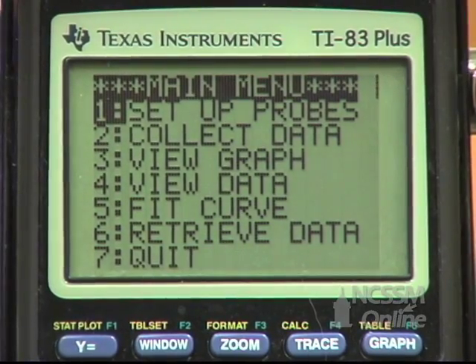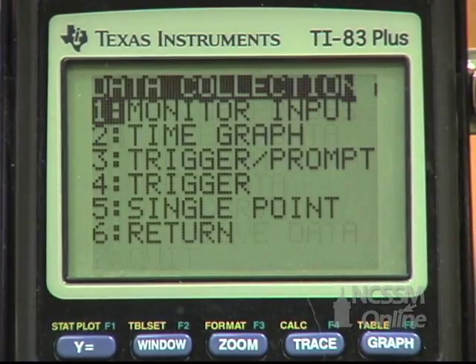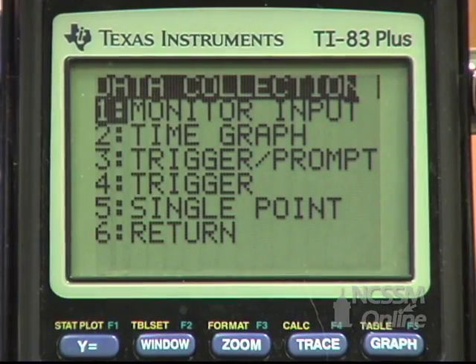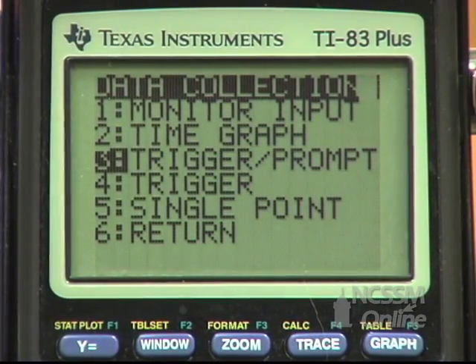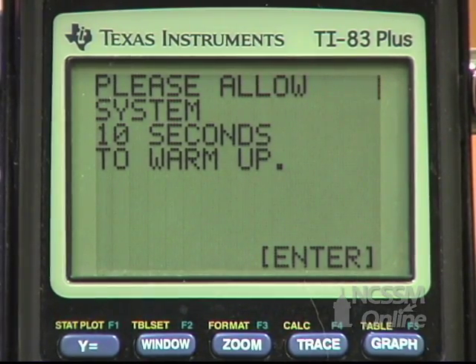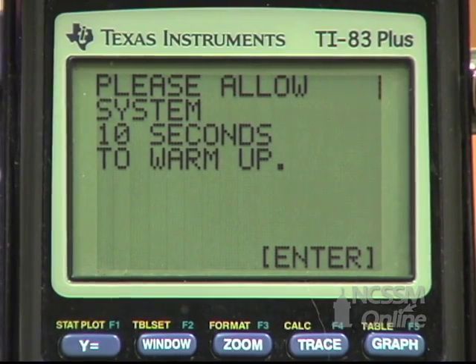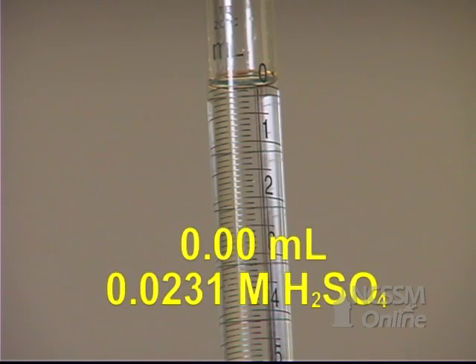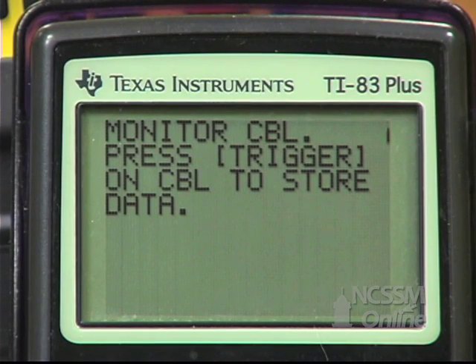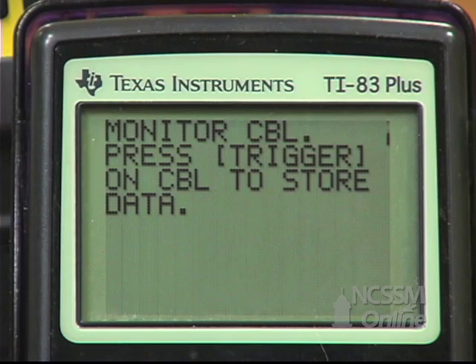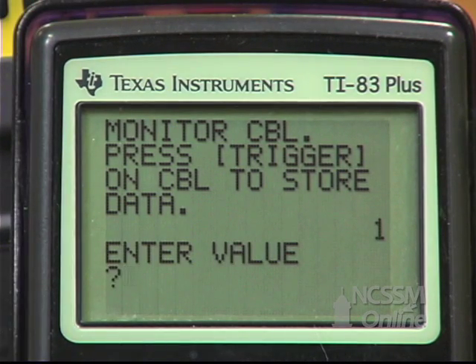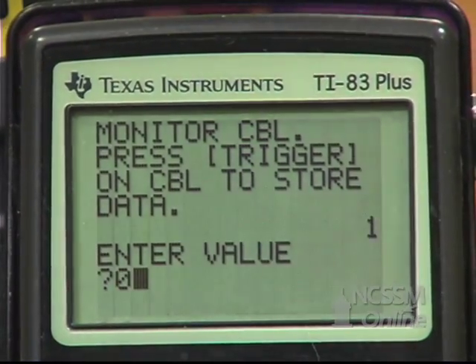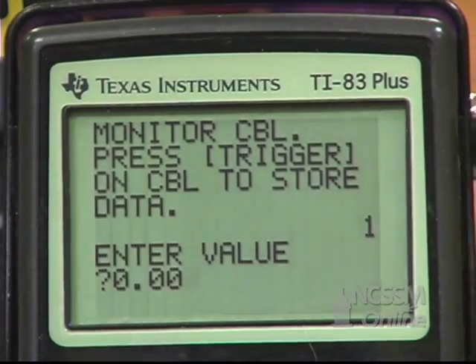We'll take our conductivity probe out of the distilled water, put it in our solution, and clamp it in position. We want to make sure that our magnetic stir bar does not hit the probe. We're ready to collect data — arrow down to Collect Data, select Trigger Prompt, and press Enter. Wait 10 seconds to warm up. Our first data point will be with 0 milliliters of sulfuric acid added. When the CBL reading is stable, press Trigger on the CBL and enter a value of 0.00 on the calculator.